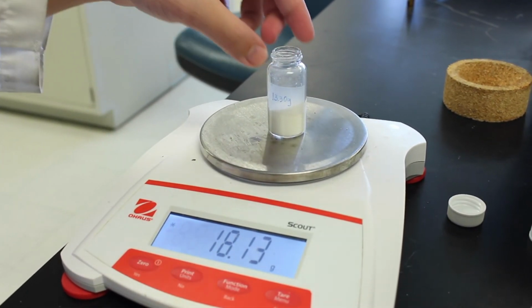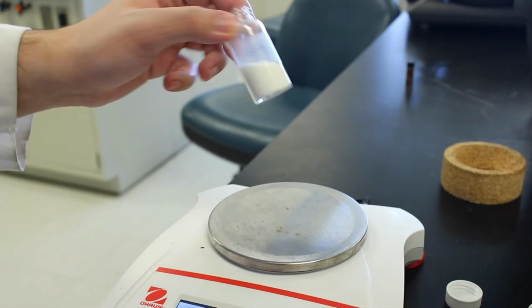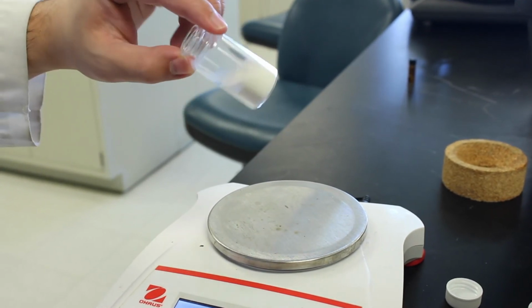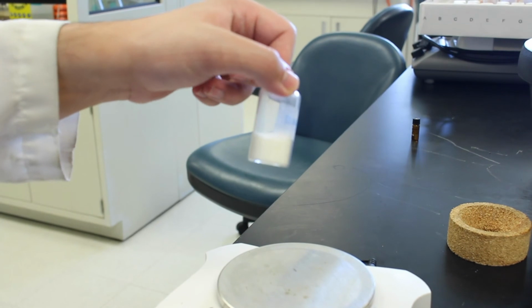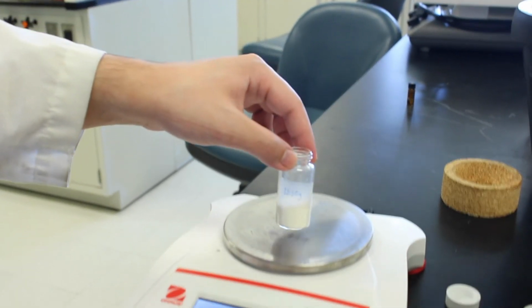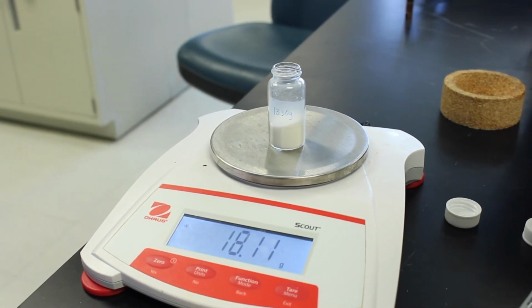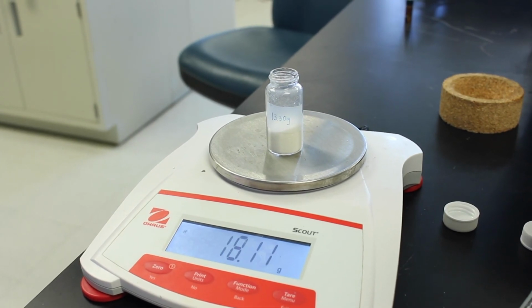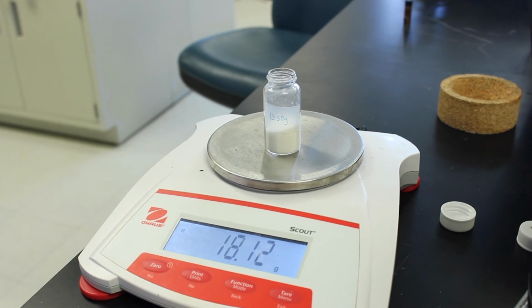Okay, so our product, we've dried it in a desiccator to get rid of any water or hexane under vacuum. So as you can see, it's nice and white, not very much yellow, indicating that it's pretty pure, but we'll also put it in the mass spec to check that it's pure. And the mass on it is about 4.82 grams. Okay, so you can use that to calculate your percent yields.